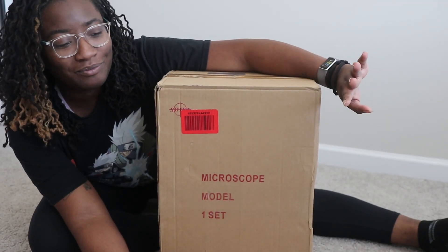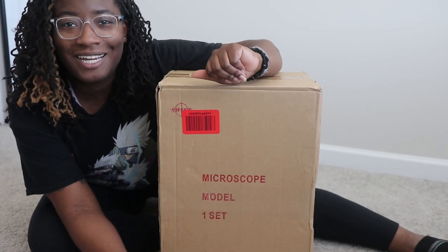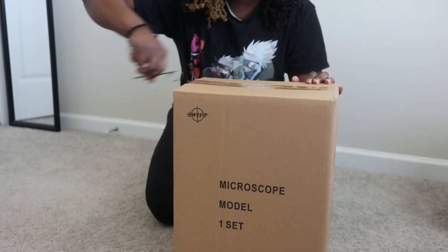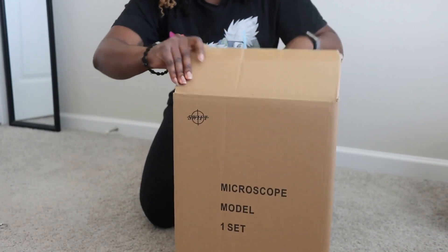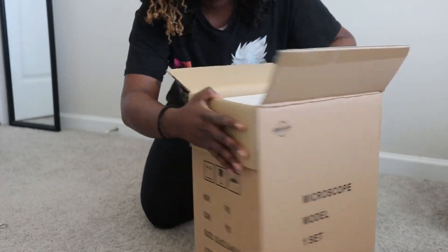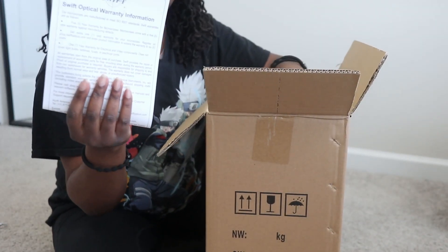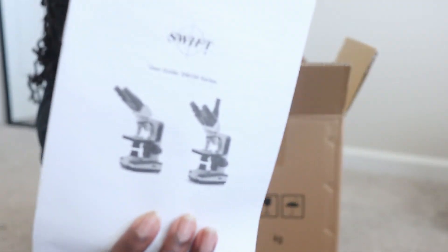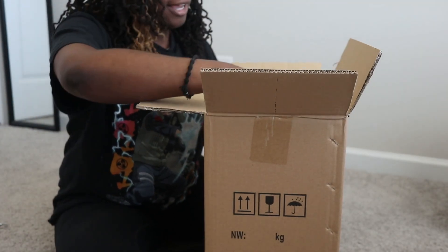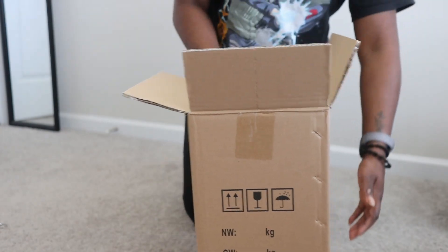My microscope just came in the mail, so we're going to be unboxing it together and I'm so excited, I cannot wait. I have my warranty, and this is the SW350 series, and it's packaged pretty nice, so let's get into it!